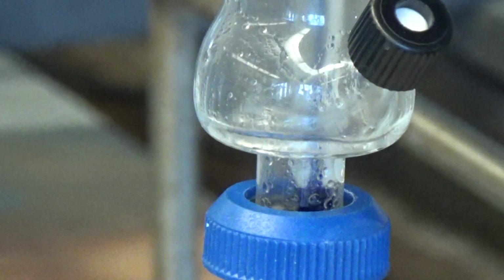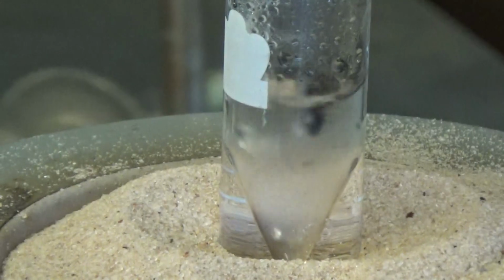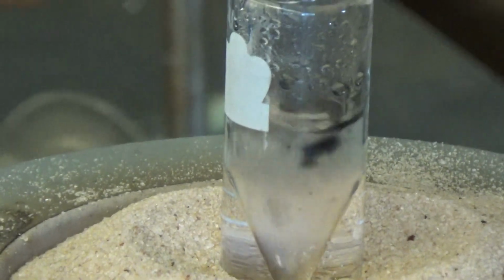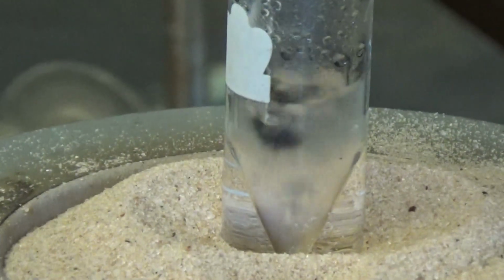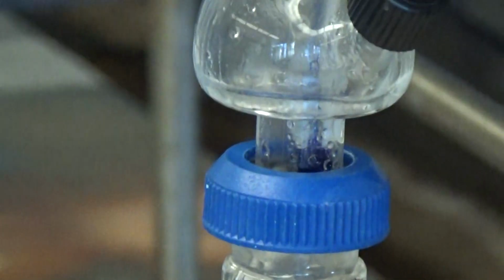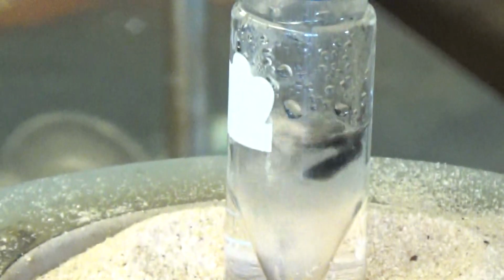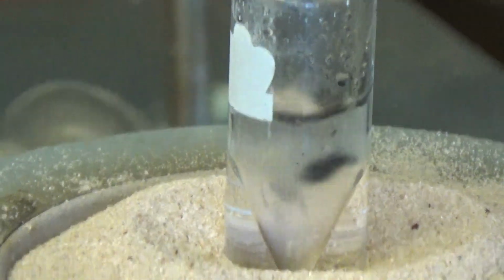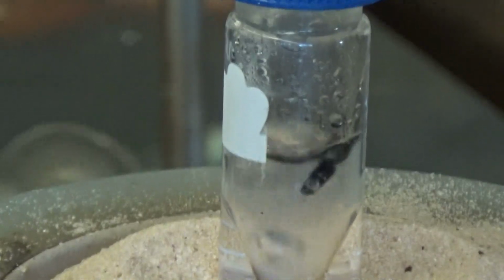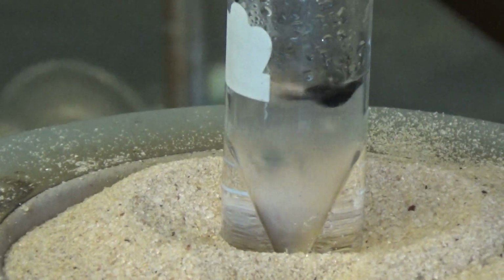They made a new molecule, huh? You go basically from a diol to a ketone. Diol to ketone, that's right. With a cool mechanism. They're slowly learning mechanisms in class. Three steps. I will do them on the board. Good. It's coming, it's condensing well.